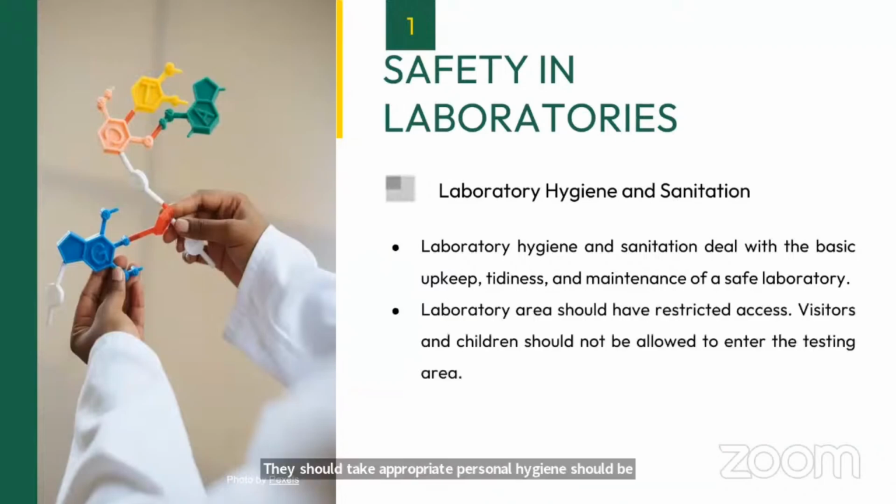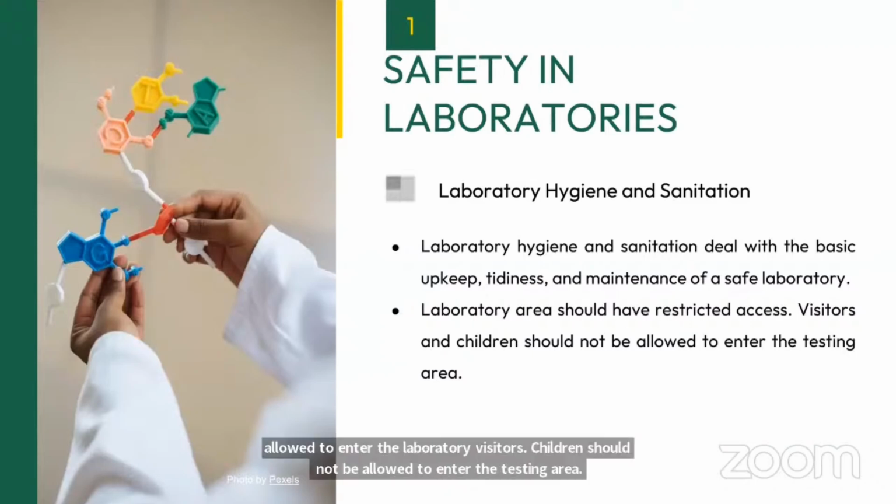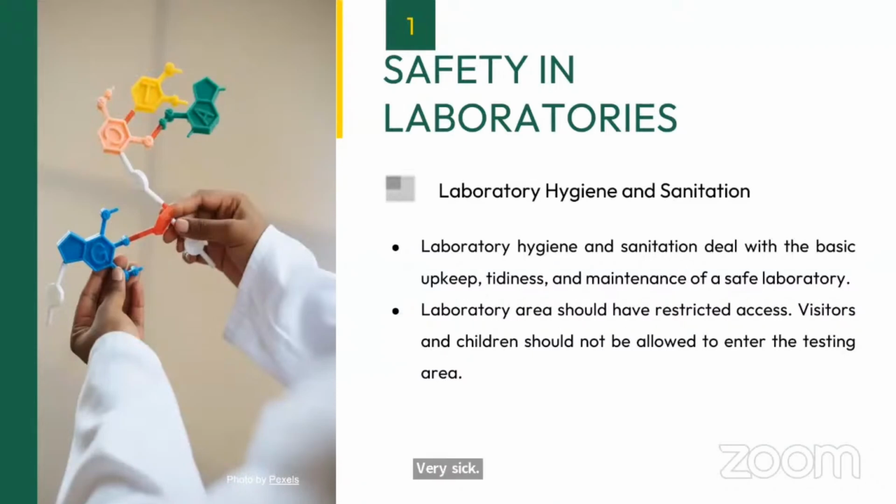Laboratory areas should have restricted access. This we have seen already in the infrastructure. There should be restricted access. Not everybody should be allowed to enter the laboratory. Visitors and children should not be allowed to enter the testing area. Very strict. Why do visitors and children have to enter those areas? It should be strictly restricted.